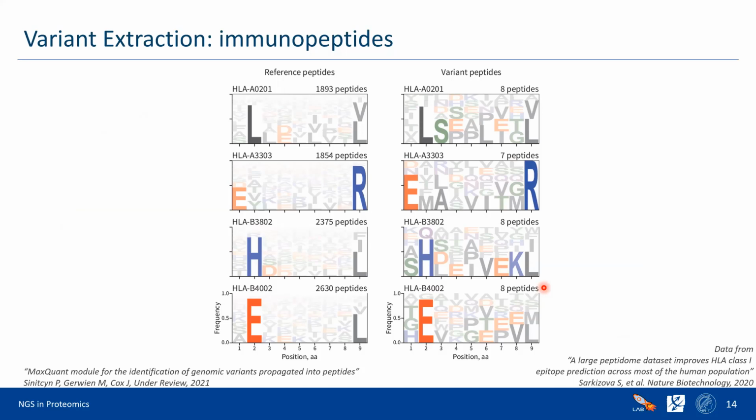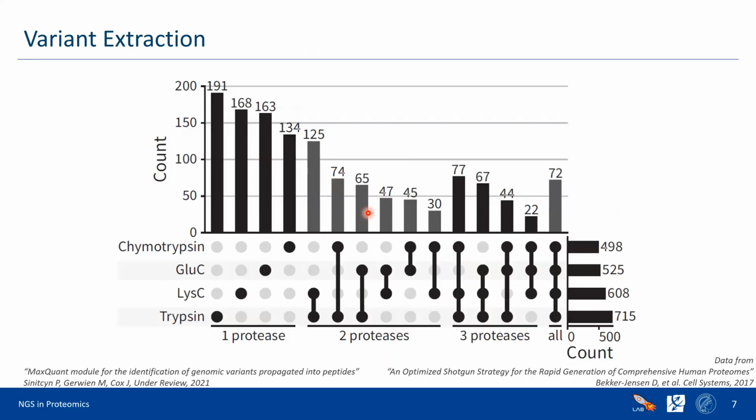As I said, you remember that previously we were able to find variants when we used a database constructed based on the different proteases. But we can also use unspecific search. We can say that now we'd like to search for all peptides of length 8 to 11, both ends included, and all peptides there which do have a mutation would be interesting for us.